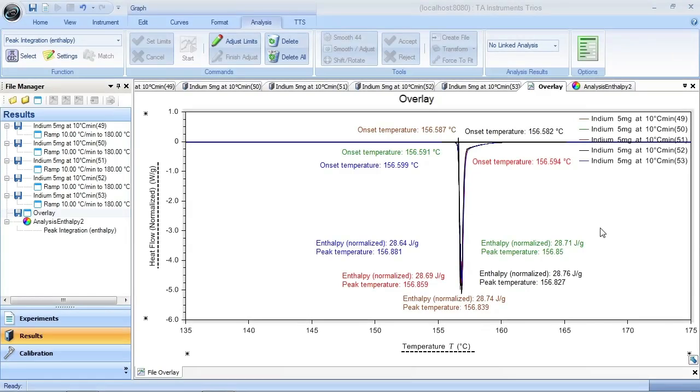Using Analysis Reports, we can easily create customized tables of results, and these results can be graphed and further analyzed. For instance, we can track results over time or any other user-defined variables. This feature is easy to use and I'll show you right now.